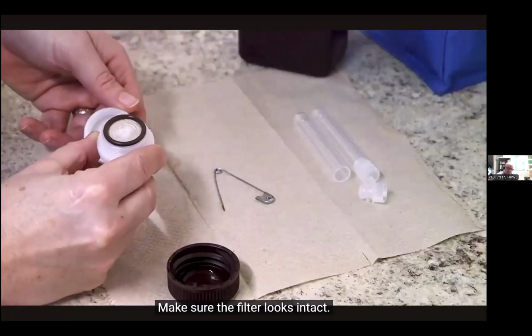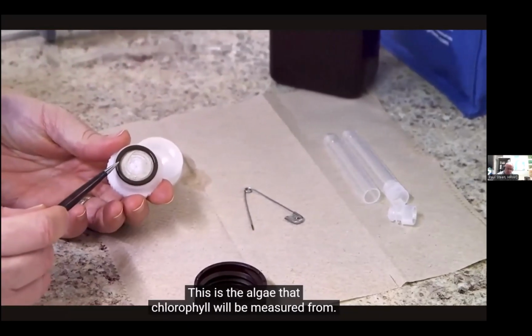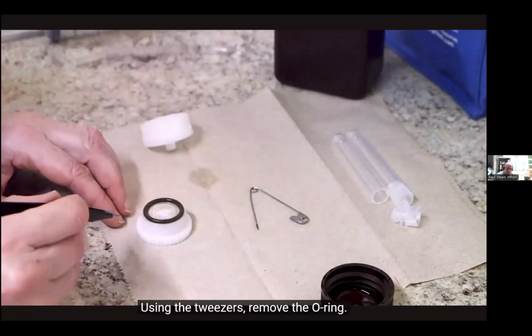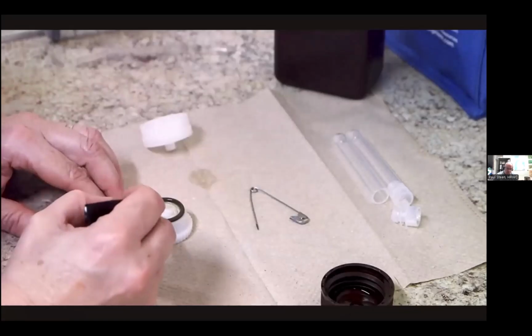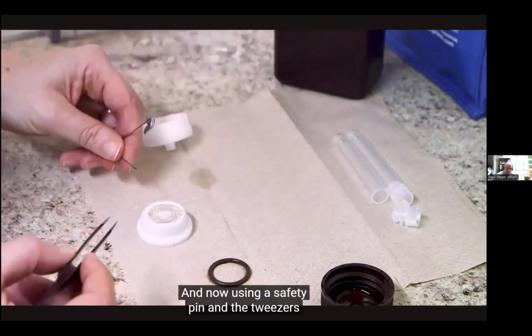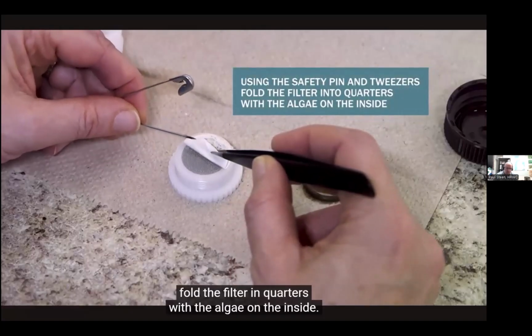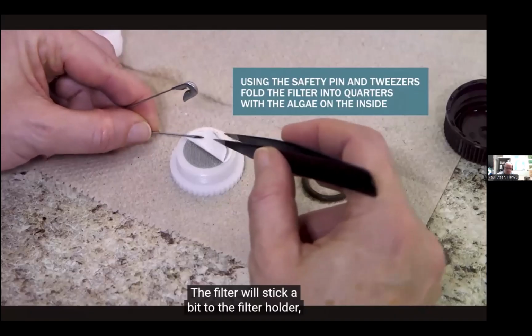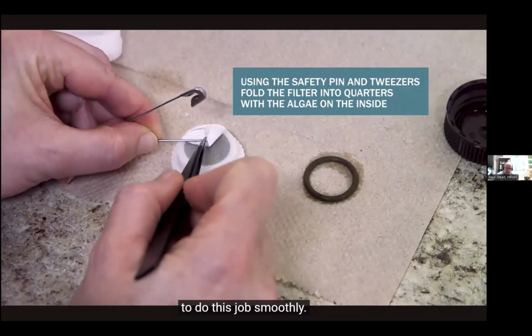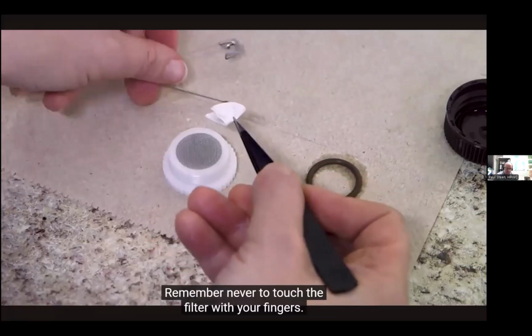Make sure the filter looks intact. It may look slightly green or brown. This is the algae that chlorophyll will be measured from. Using the tweezers, remove the O-ring. And now, using a safety pin and the tweezers, fold the filter in quarters with the algae on the inside. The filter will stick a bit to the filter holder, and it requires a steady hand and some practice to do this job smoothly. Remember never to touch the filter with your fingers.